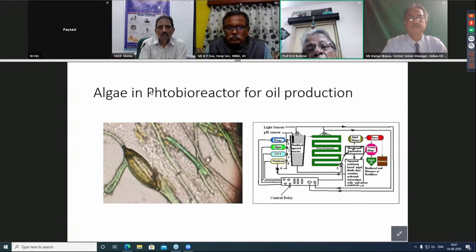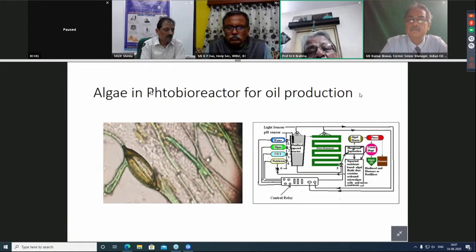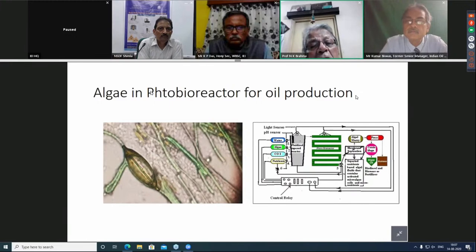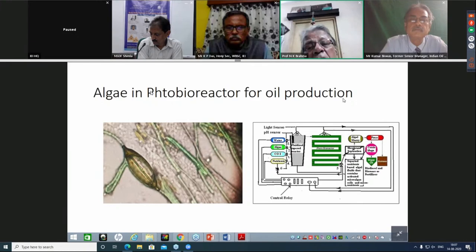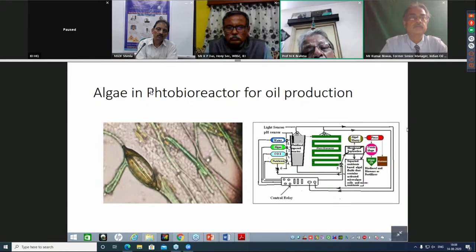Now, my objective here was to see how these algae are growing in my reactor as well as in Anindo Mahapatra's reactor. So we have taken that, and I have prepared the slides. We have looked at how the oil seeds grow. Now we can see the oil seeds growing, and if you enlarge the plate and observe, you can see many of these seeds growing, and that proves that these algae are competent to make oil seeds, and you can extract the oils from the algae according to the process that I'm not going into here.